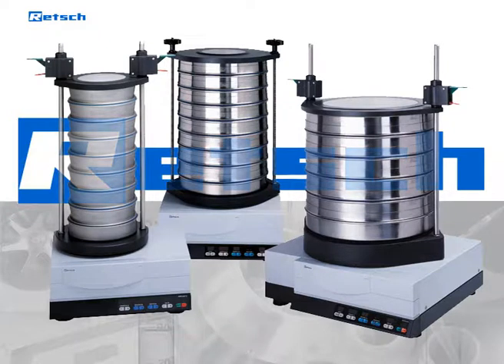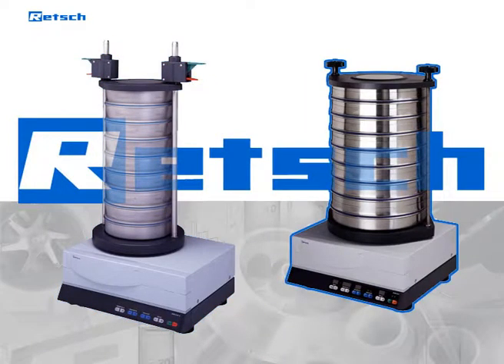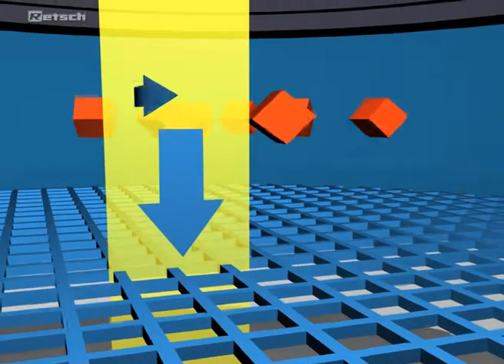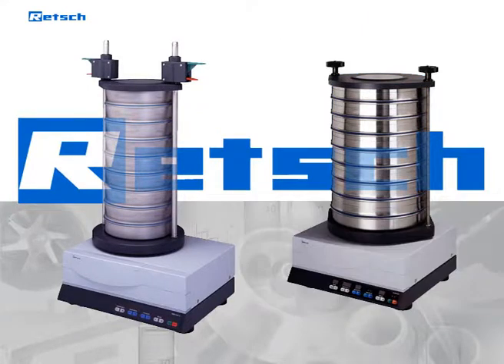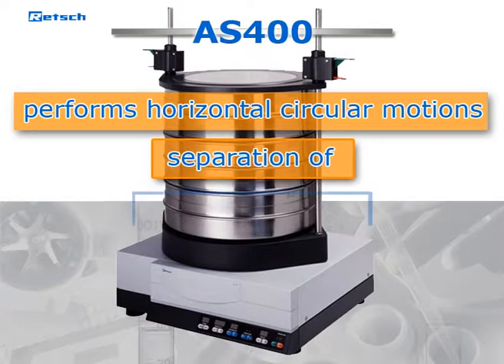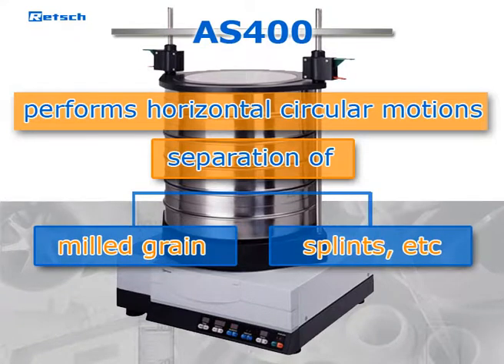Retsch sieve shakers are available in different models to support the various needs of customers. All sieve shakers of the AS200 and AS300 series work with a drive that produces a 3D throwing motion. The AS300 provides a two times larger sieving surface and handles heavier sieve stacks of up to 10 kg. The AS400 performs horizontal circular motions, which is particularly suitable for the separation of products such as milled grain, splints, and similar materials, and is also required for testing plastics.